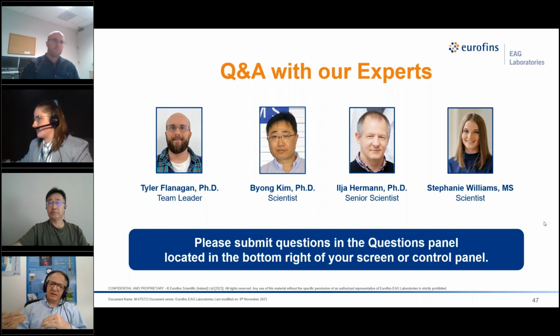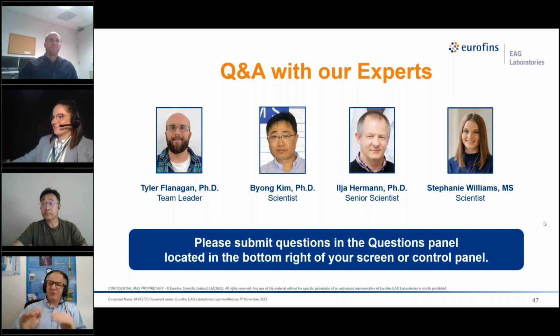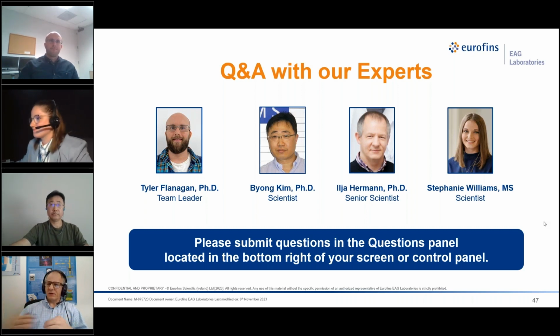Great. And nanoindentation, then go ahead, finish. We can measure this with nanoindentation as well. It's just we can apply higher loads as well, so that it becomes negligible to some extent. Okay, great. And then we'll finish it on one last question.